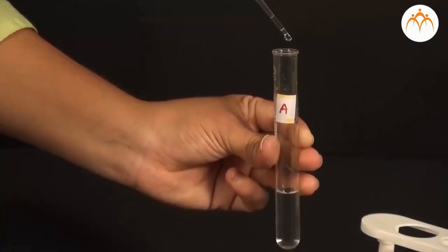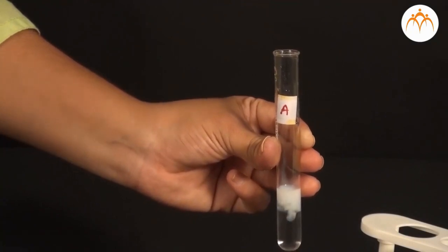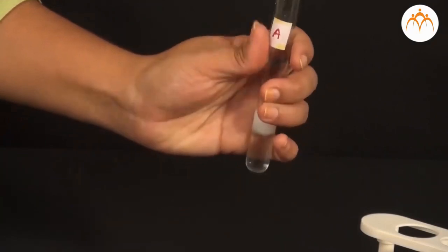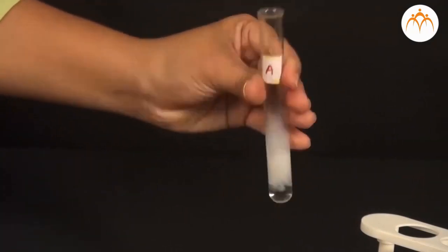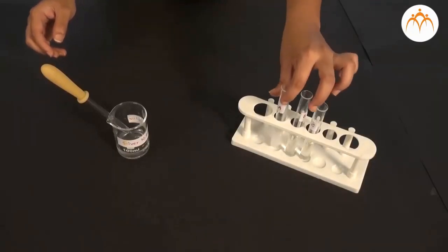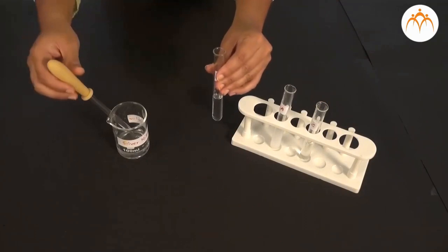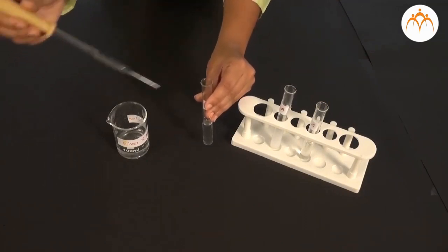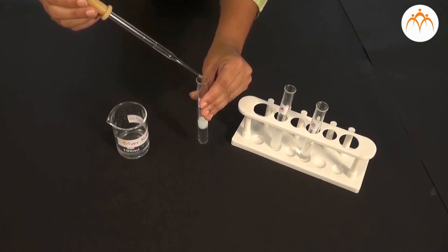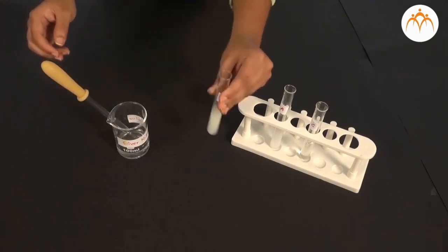As soon as you add silver nitrate, we find that a chemical reaction starts and some product is developed. This product is not a liquid but it is solid. Such a solid product that comes out of the solution is known as a precipitate and the process is called precipitation. In all 3 test tubes you will find precipitates. It means that when silver nitrate reacts with these 3 compounds or solutions, a precipitate is formed.